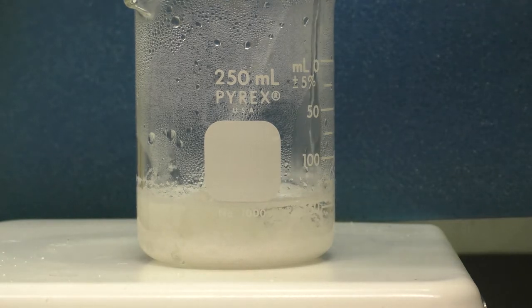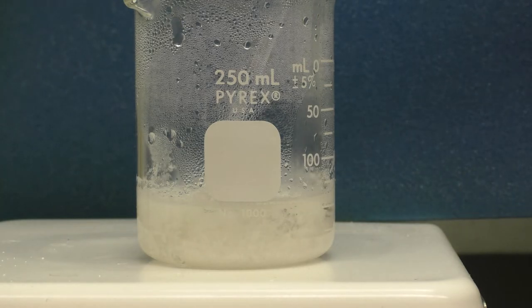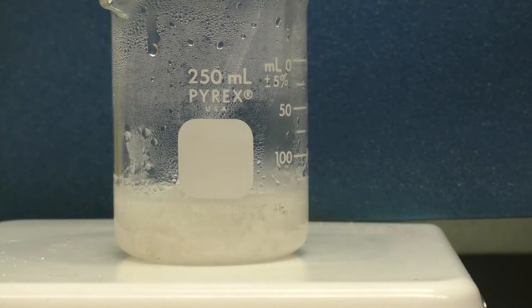Just taking a little bit, maybe more liquid at first. You see that cooled it down a little bit. We'll let that boil again, and then add more distilled water as necessary to dissolve all of the material. Once everything is dissolved, we can remove the beaker from the hot plate and let it cool and crystallize.